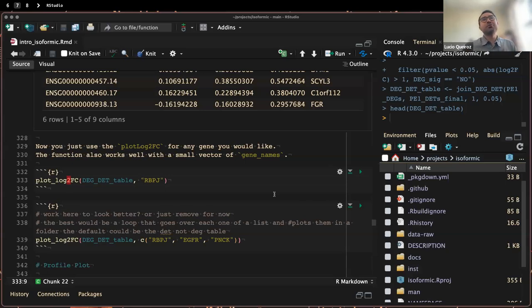It's just that this is a good approach, because when you move from gene level expression to transcript level expression, the main assumption on the differential expression analysis, like on DSeq 2, is that you have a negative binomial distribution of the count of reads. And actually for transcripts, we don't really know that by RNA, and we don't really have that distribution following all the transcripts of a gene. So actually we have a better estimate using a non-parametric approach, like it's implemented in the Swish method.